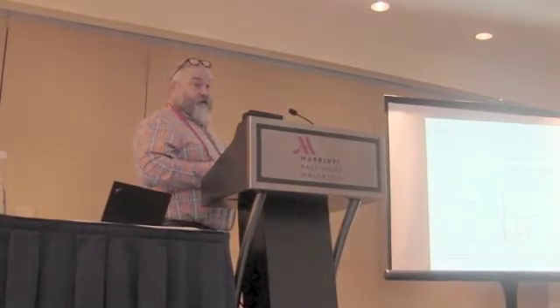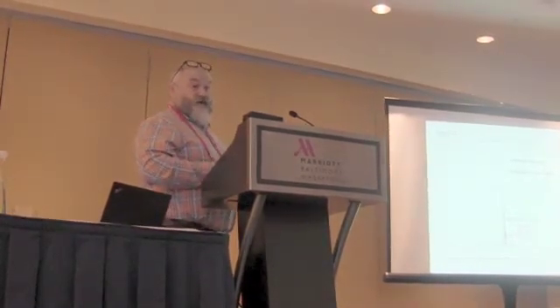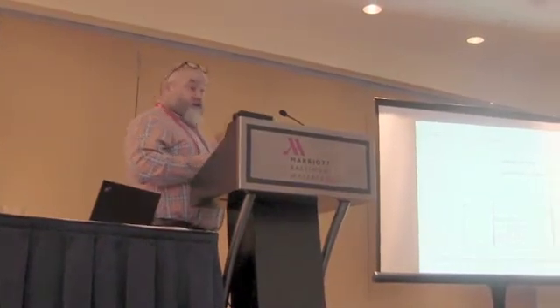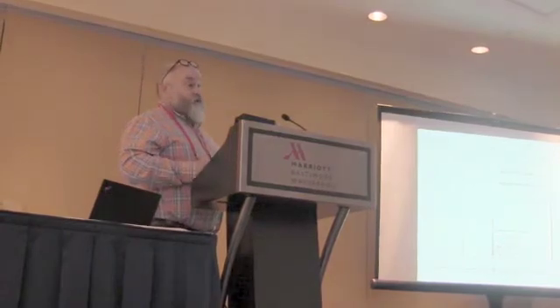And so what we're doing in this spectroscopy is manipulating those magnetic fields. They spin at a rate that's like a radio frequency. So they're going at like 200 megahertz, 40 megahertz, like FM radio kind of frequency ranges. So you hit them with radio pulses, and you can get signals back that you can then interpret. This is where people always fall asleep, and so it's not worth going into it, to be honest.